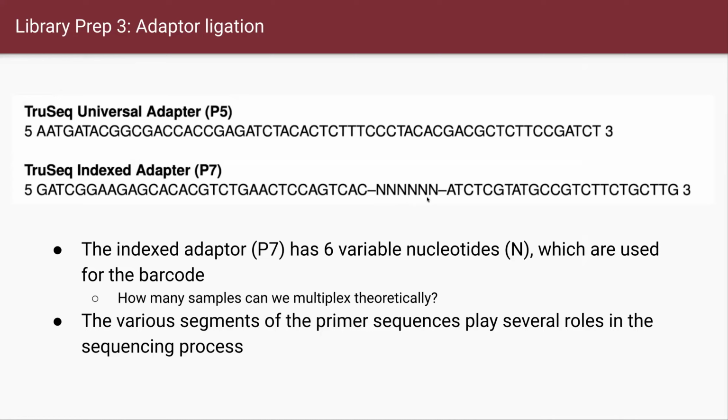Why do we need that? For instance, if I sequence myself and three more students from the class, so we sequence four people including myself, and you make a library and put the library of these four people into the machine, the machine cannot tell which sample is from which person, right? So we want to make sure that we give barcodes to each sample.